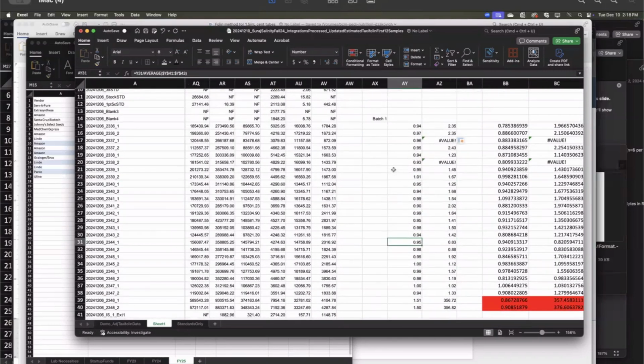So on a mass spectrometer, for each sample there could be random variation just from the instrument itself. Mass spectrometers are notoriously unstable because of the quality of the nitrogen coming in, or the flow rate, or the temperature. Most of that is pretty stable, but especially with triple quads, you tend to see a little bit of drift throughout the day as your source gets a little bit dirtier with each run. There are matrix factors that accumulate on the source and diminish the ionization efficiency that you get. So we actually have to correct these values for that instrument noise.